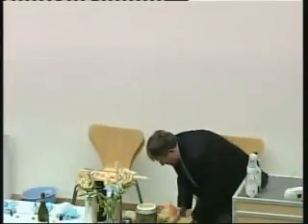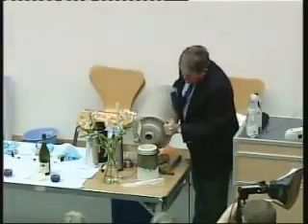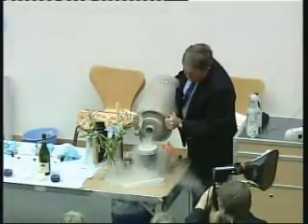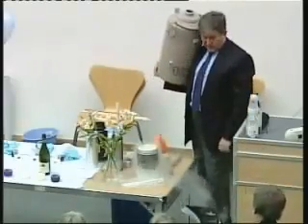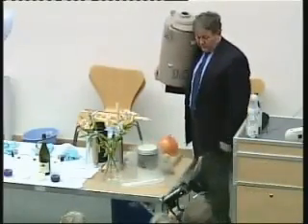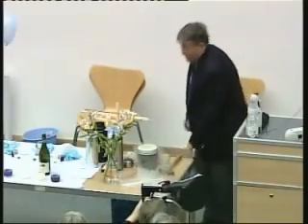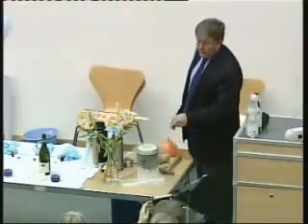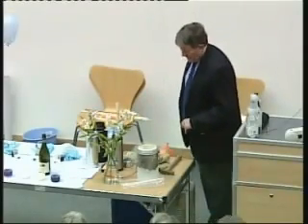So if I can, without taking too long, just pour out some of the coldest stuff that I have easily accessible. This is liquid nitrogen. It's nitrogen from the air which has been liquefied. And it is very cold. It's minus 196 centigrade.